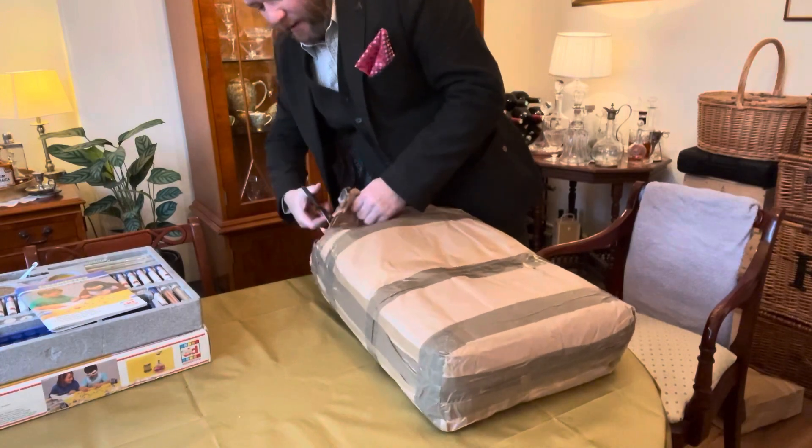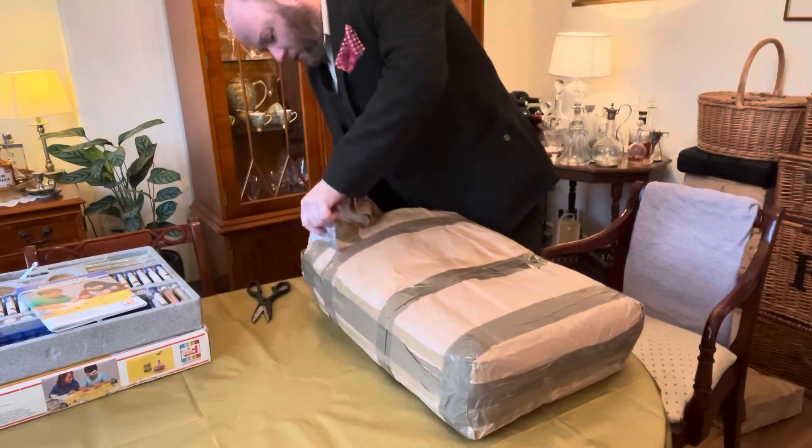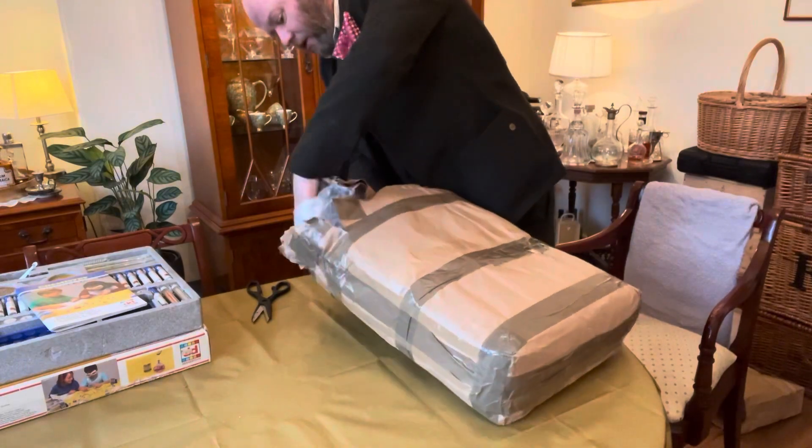It turns out it's a 1967 Merritt set. Hopefully nothing has leaked out.